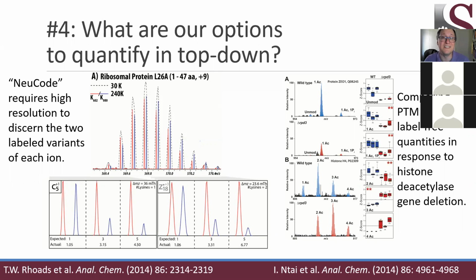Sometimes those peptides are translated at a ribosome, but sometimes they're assembled completely differently and use non-standard amino acids. So for stuff like that, you really need as much support as you can get to interpret the spectra that come back. But natural product mass spectrometry is definitely growing as a real technology that can be used quite practically. It is growing. Okay, thank you. Good question. Thank you.